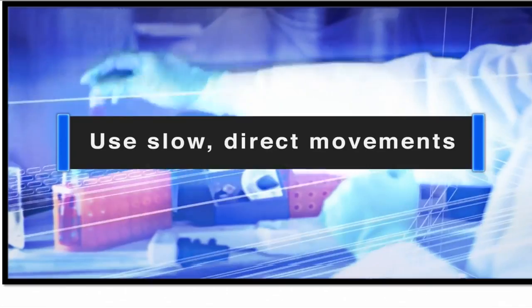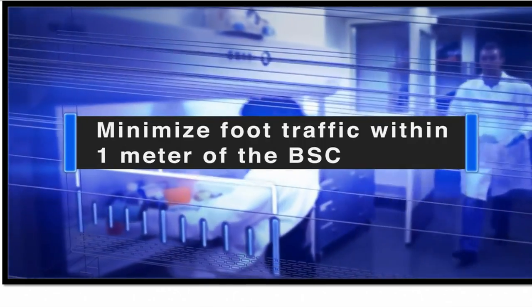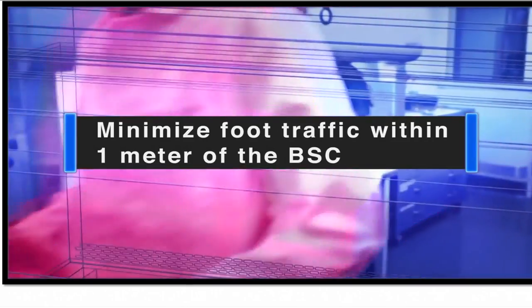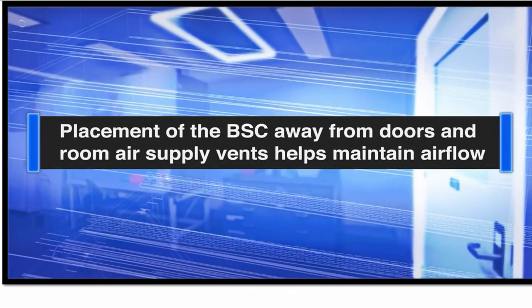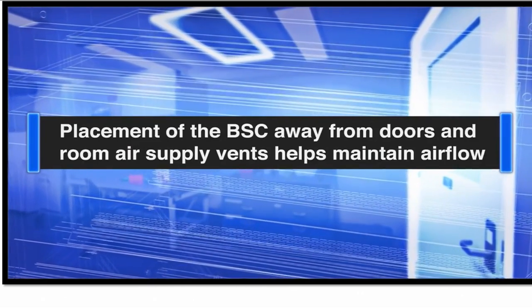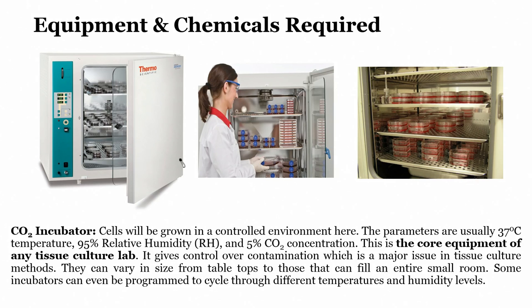Use slow, direct movements. Minimize foot traffic within 1 meter of the BSC. Placement of the BSC away from doors and room air supply vents helps maintain airflow. So now, having seen the video, you have an idea of how a biosafety hood works, right?